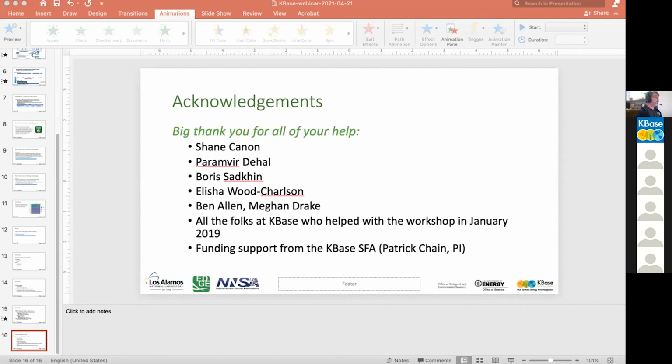If the reads aren't in the reference database, then yes, they will not be found. We're trying to keep them up to date. I think the latest one was done in the fall of 2020, so we're maybe due for another update to the reference database.